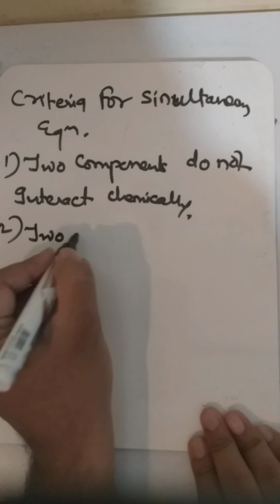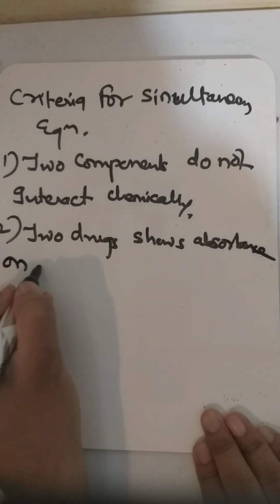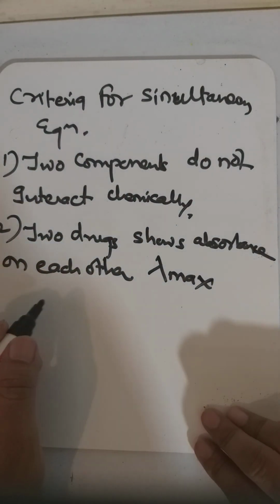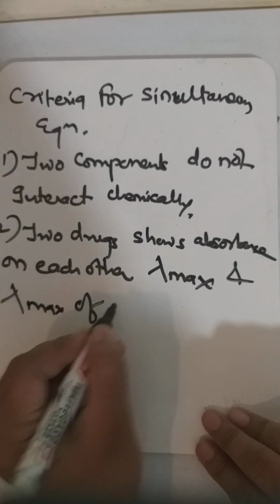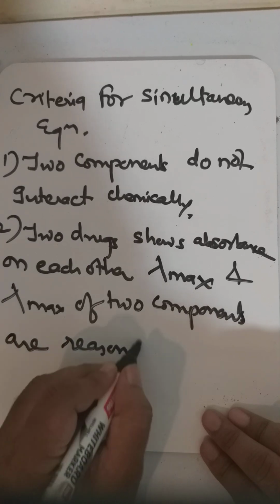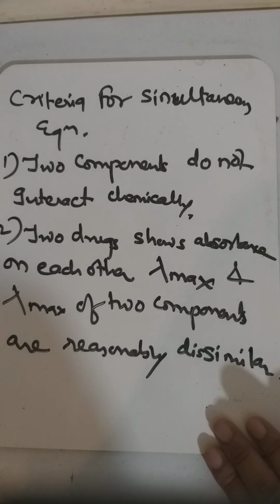Second, the two drugs show absorbance at each other's lambda max, the maximum wavelength. Okay. Are you getting what I am saying? And the lambda max of the two components are reasonably dissimilar. Okay. So these things are there.